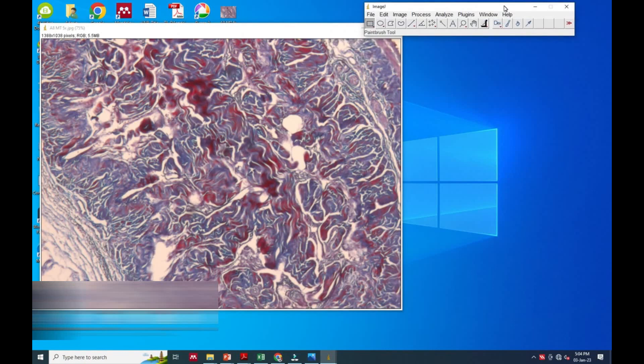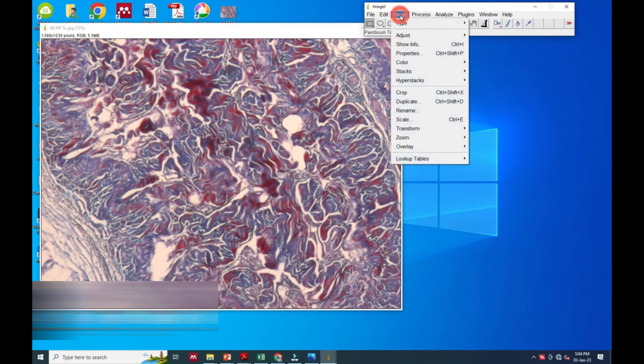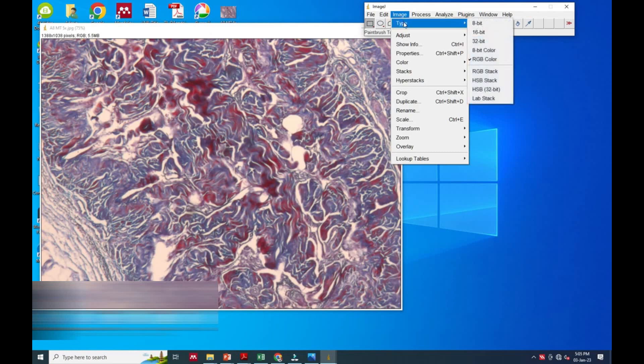So now we will measure the blue area. You can see this part in the image - the blue area we have to measure. For that, we will first select the image in the ribbon.